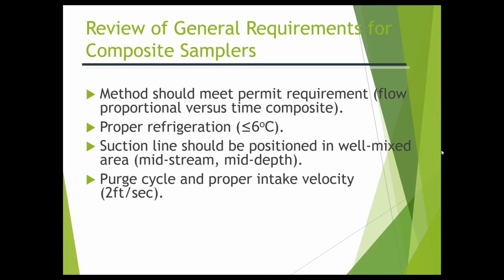And then your proper intake velocity needs to be 2 feet per second. It needs to be 2 feet per second because we know at 2 feet per second, solids stay suspended. Now, how can you measure this? We really don't. So I'm going to give you a tip there.